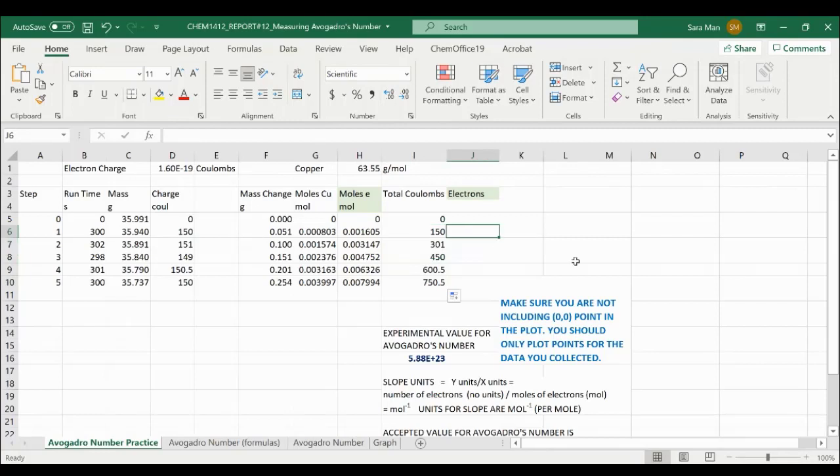And we are very, very close, because how did we say we complete the number of electrons? We said that we divide the number of coulombs, which is this column, by the charge of 1 electron. And I enter that in this cell. You can write the number, or you can do it in a different way. For example, this one is going to be 0. Very good. So how can we do it?